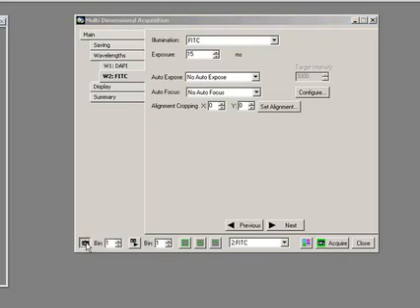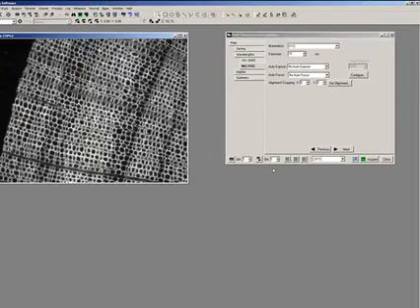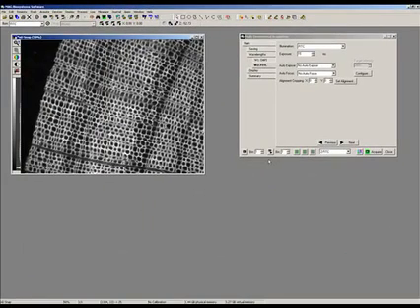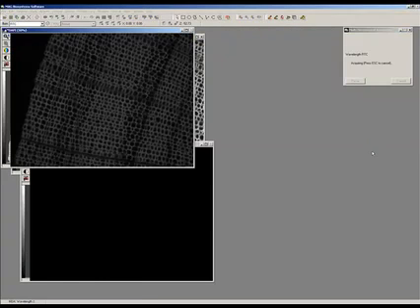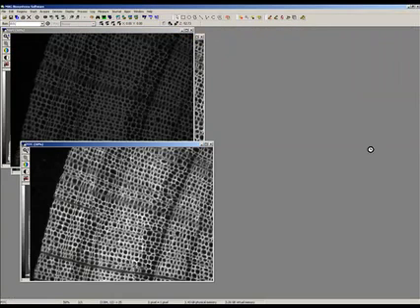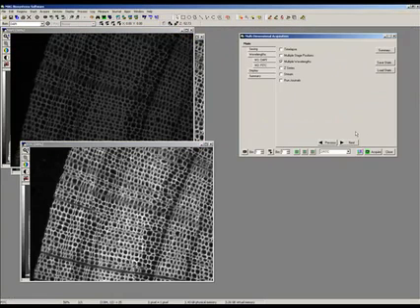So I can now say snap, and I get one picture, which is of the FITC, but if I wanted to take both, I would press the acquire, and that's both saved.